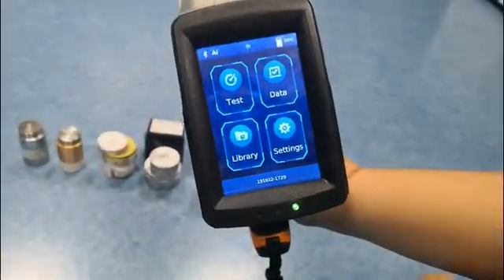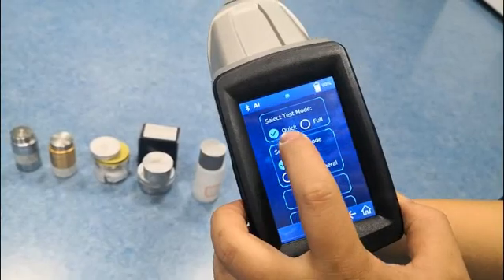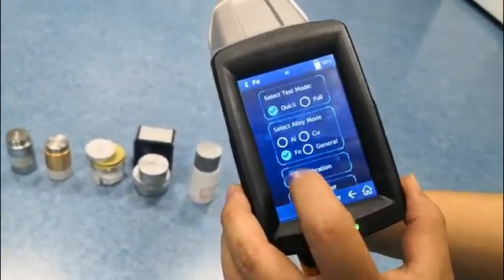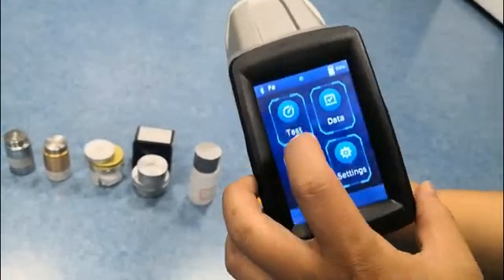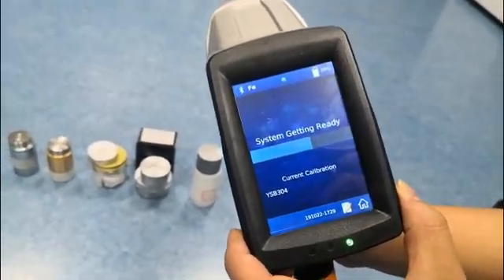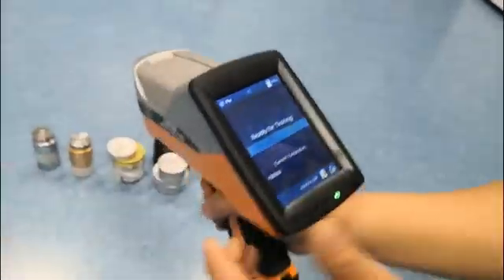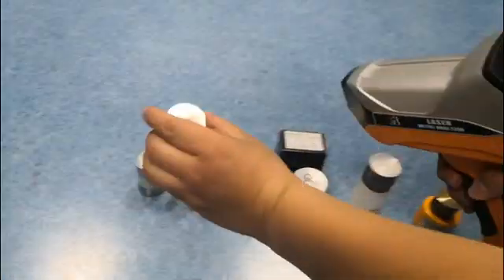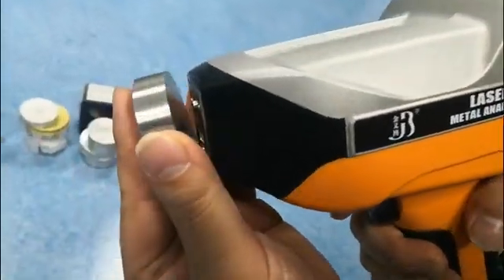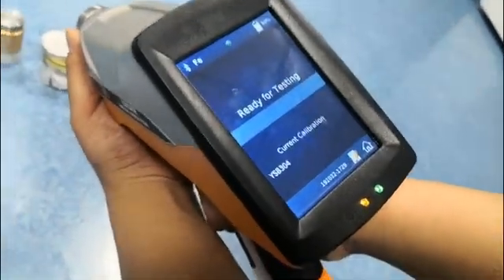We will choose the setting — quick mode — and select iron base. That's ready. Now we can test this stainless steel sample. We put the sample here and the yellow light turns on.